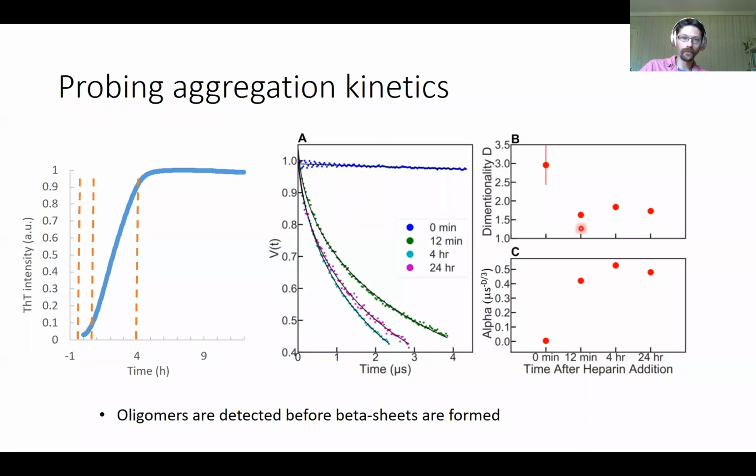Then I'd be much more skeptical of interpreting D values as relevant to your system. This is much harder because you have a mixture. Even if you only have, let's say, 10% of fibers, because they're so close to each other, aggregated together compared to the 3D bath, this is going to have a huge contribution on your alpha.